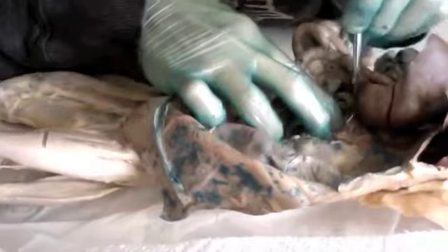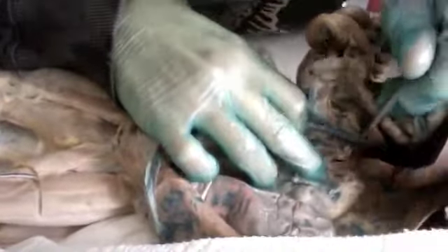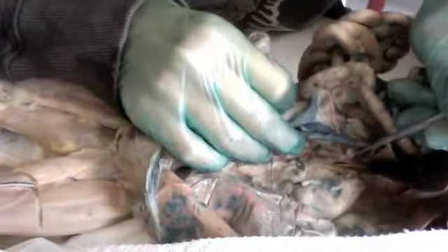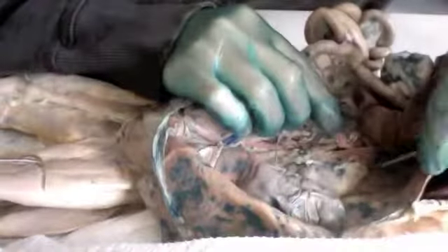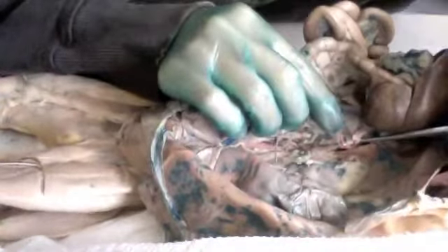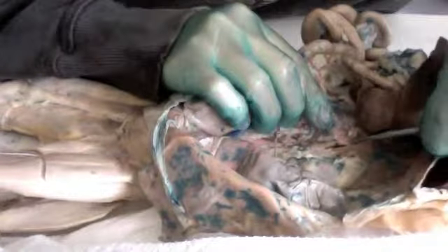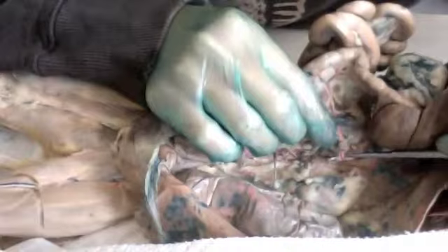This is the celiac trunk here. It's oxygenated right here. Celiac trunk, and then directly beneath it is the superior mesenteric artery, which is here.